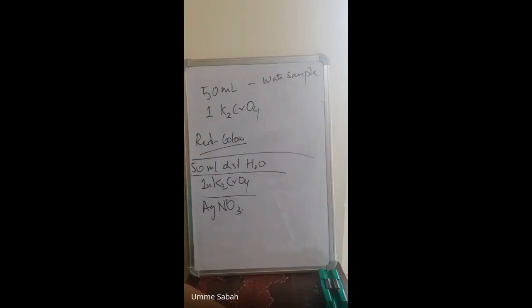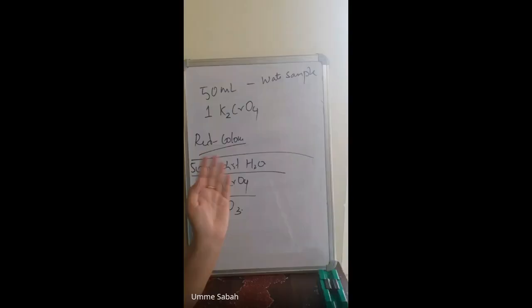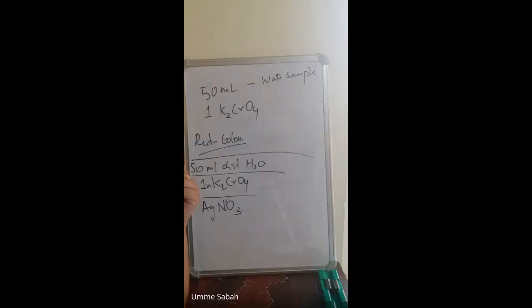Ma'am, M2 and M3, can you repeat please? M2 is mass of weighing bottle and sodium chloride, that is together you are checking the mass. Then M3 is mass of weighing bottle with sodium chloride after transferring. It will be same, no, ma'am? While transferring you have to check, because of air, some particles of sodium chloride are removed. All these things matter. Error occurs. Even a small particle is very much important here in salts. Ma'am, M2 is with sodium chloride only, right? Right. And M3 also weighing bottle with sodium chloride. Okay, ma'am. Thank you.